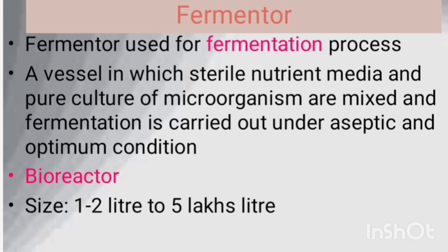Before starting with fermenter, let's see what is fermentation. Fermentation can be defined as a metabolic process in which the primary metabolite is converted into secondary metabolites. So it is a biochemical process. Details of the fermentation were given in the previous class. So let's move to the fermenter.